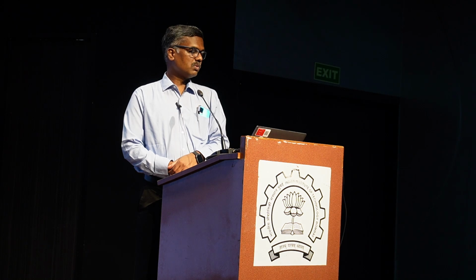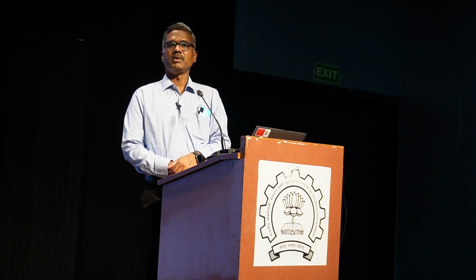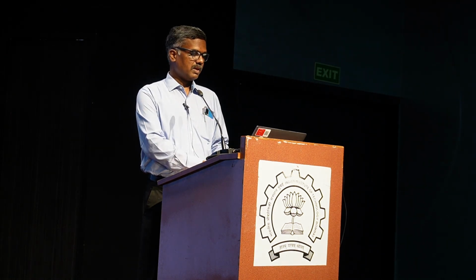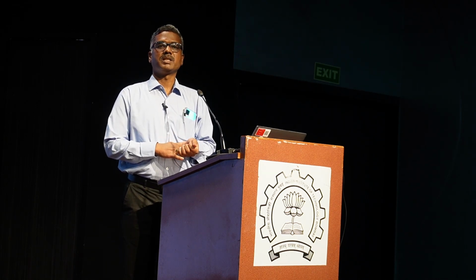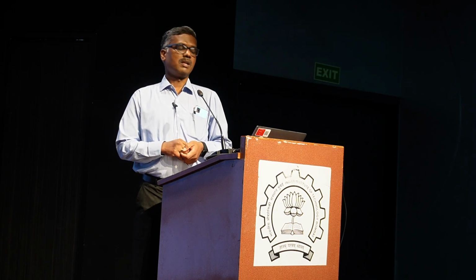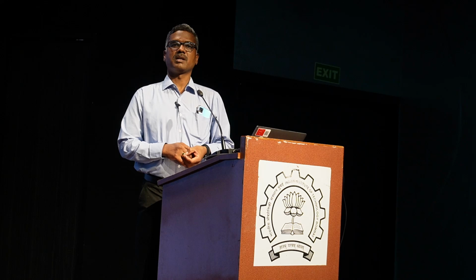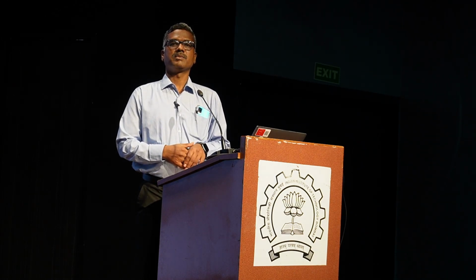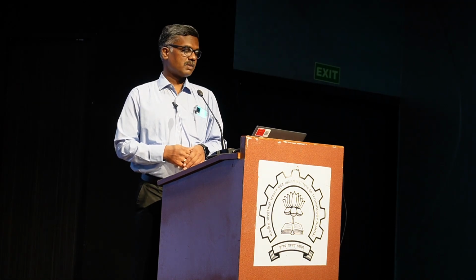So I will just go through a few of the applications, and based upon that, if you have any questions, I am happy to answer your queries also. I will talk about GC-HRMS, specifically persistent organic pollutants or any contaminants, followed by the food authenticity point of view, how we can leverage this HRMS technology to give proper justification in terms of the identification of food fraud or food purity.